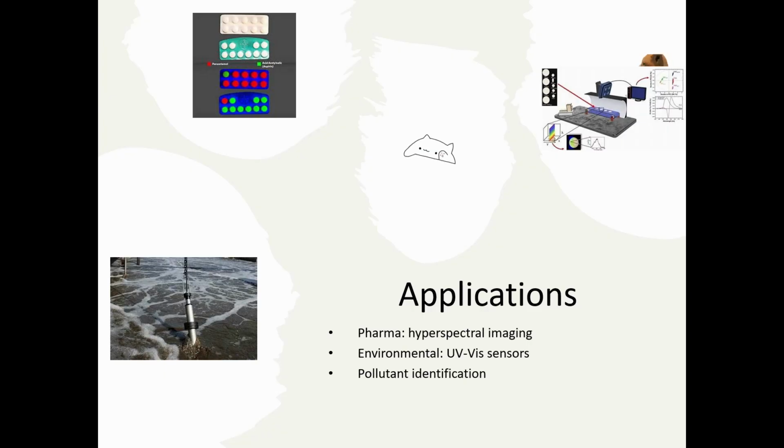Another application is environmental monitoring, especially in water treatment plants. Many modern facilities use UV-vis sensors that constantly measure the absorption of flowing water in real time. Pollutants such as nitrates and nitrites can be monitored fairly easily to see how polluted an environment is.